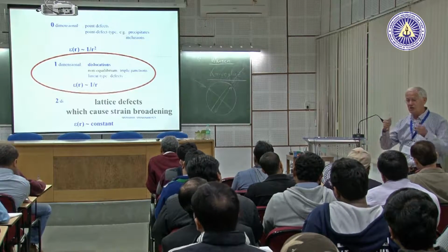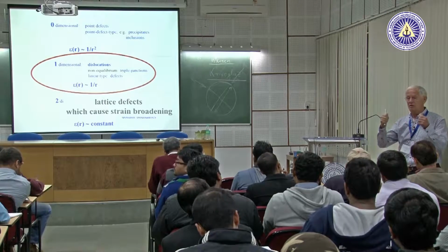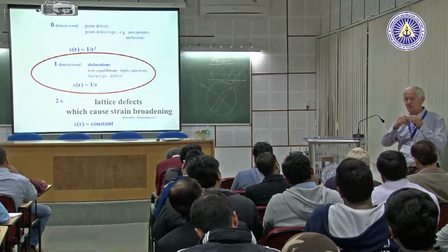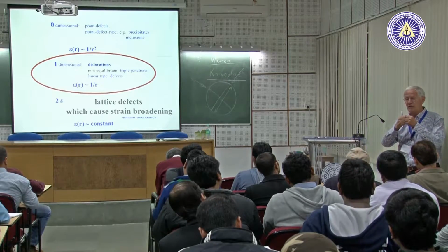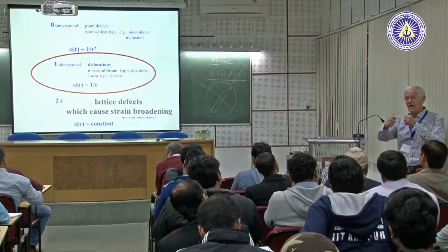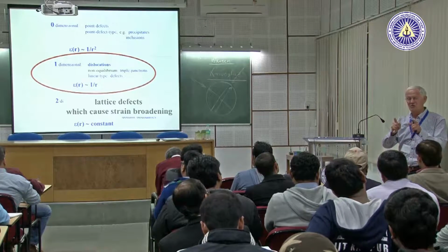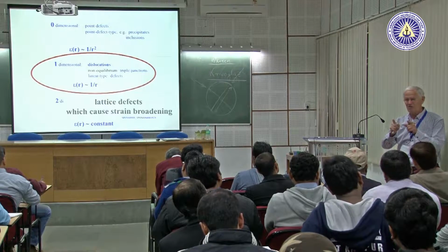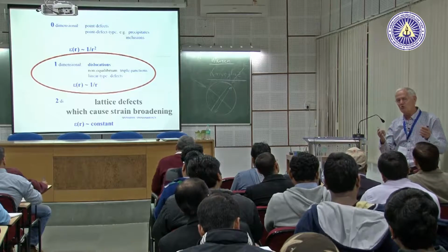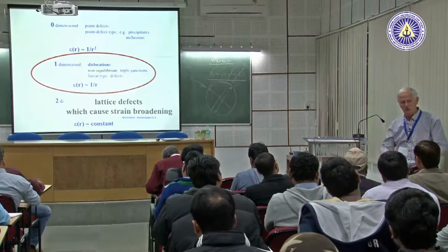If 2 particles touch each other, in powder metallurgy, you press the particles together. They are pressed in on the touching surface, and the boundary of the touching surface is a line, and that is a linear defect. So the sinter stress, this is known in powder metallurgy, is also producing line broadening of a similar type as dislocations.